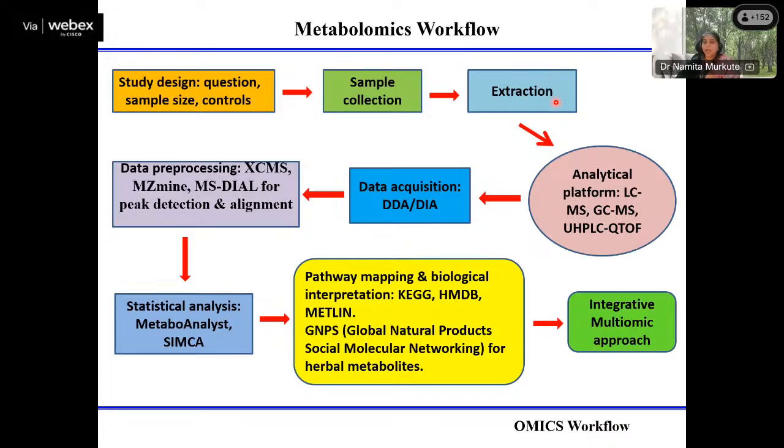So these compounds are added to your metabolome, and after adding them, these metabolites become more stable, and they can be easily detected by the detector, and they do not get exhausted before they enter into the mass spec analyzer. So mostly the gas chromatography technique needs derivatization of your sample.